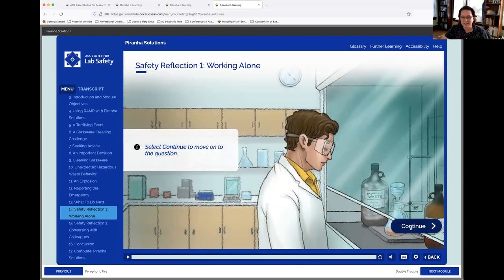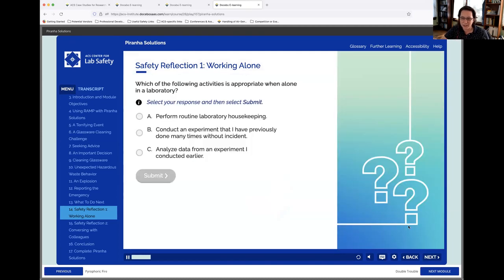Now, it is not expected that the learner be an expert in a specific subfield of chemistry to work through these case studies, nor is it important whether they work with a particular type of reagent being discussed. What matters here is that they get the opportunity to consider and explore how to react appropriately in a potentially hazardous situation, and that they get used to the idea of referring back to some sort of risk assessment in order to determine their next steps.